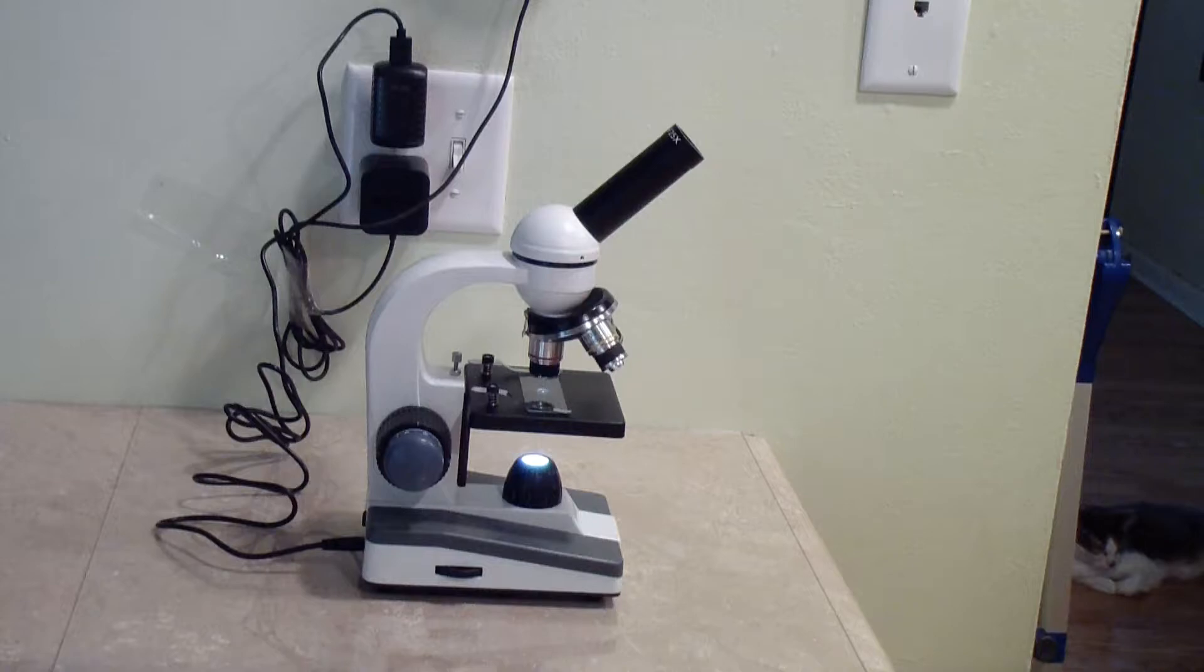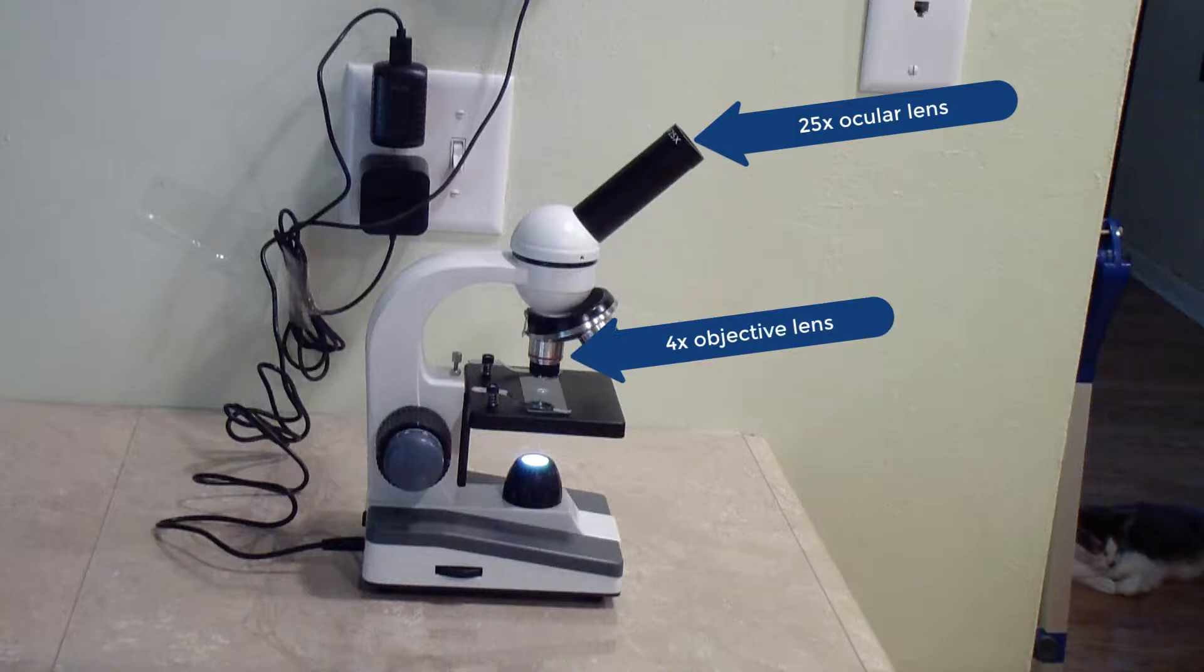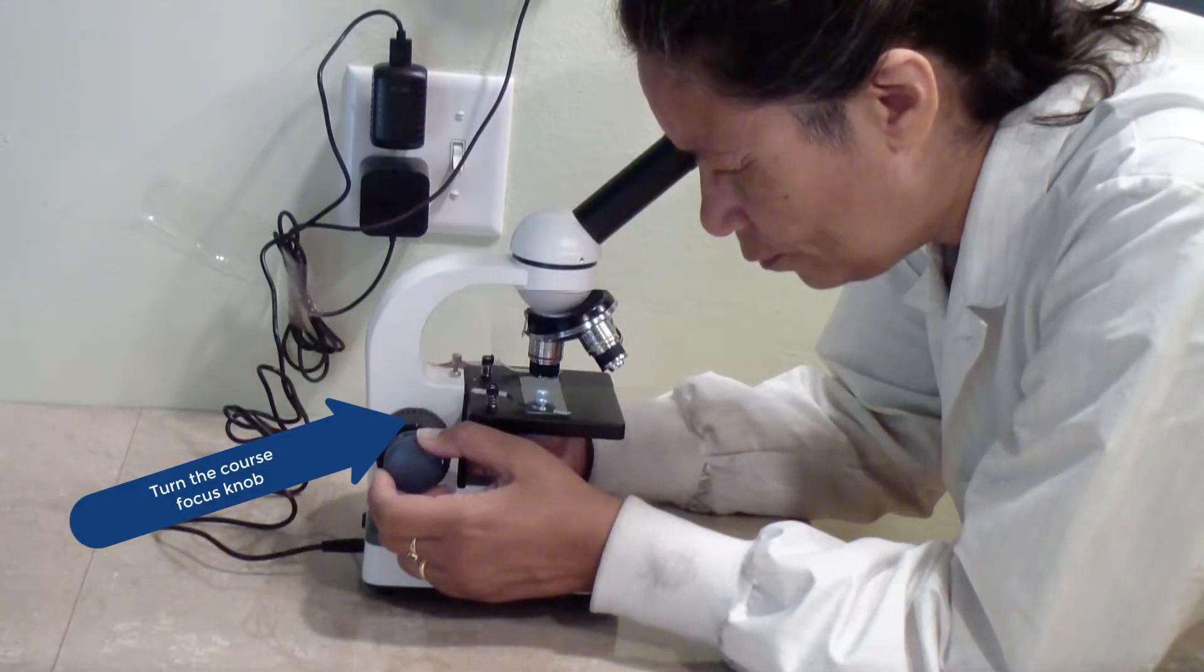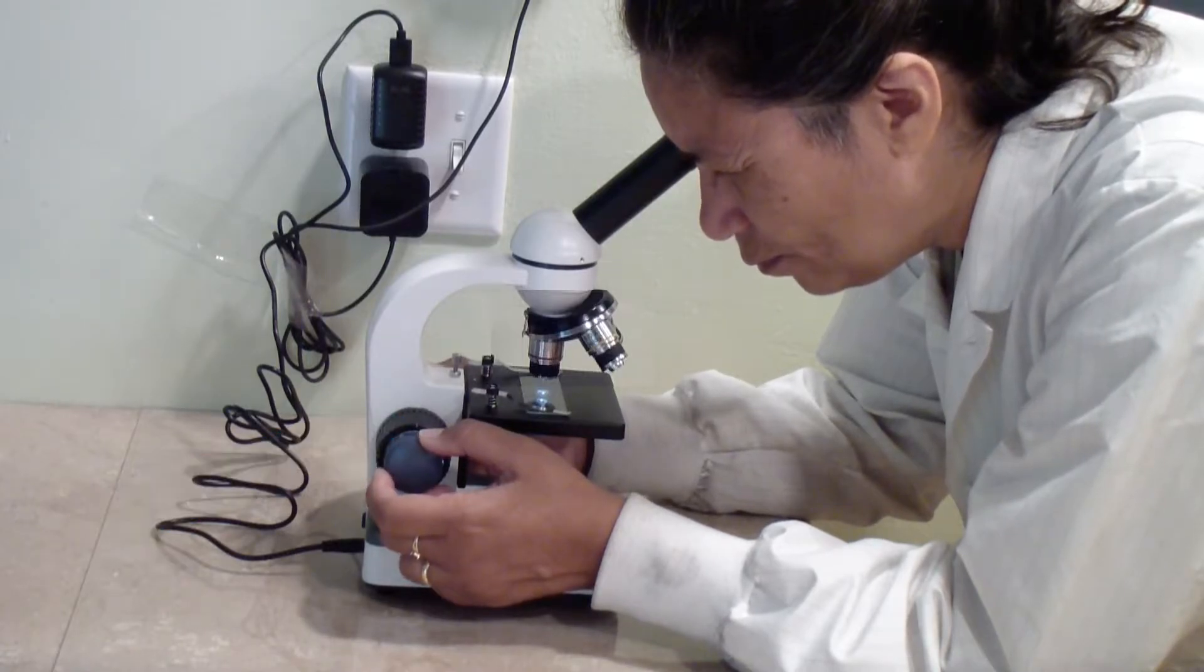Here is how you focus the microscope. Start with a 25x ocular lens and the 4x objective in place. Look through the eyepiece and turn the coarse focus knob until what you see becomes sharp.